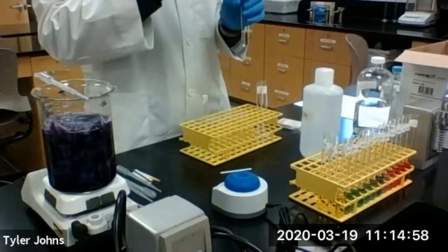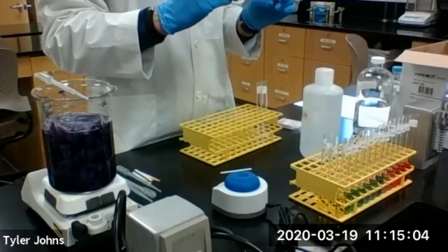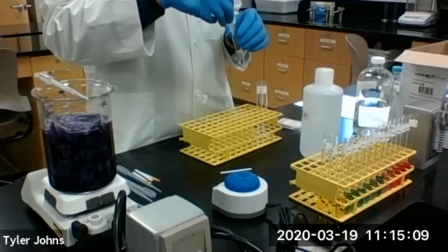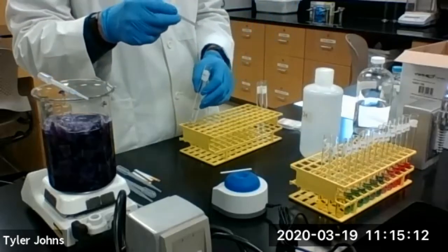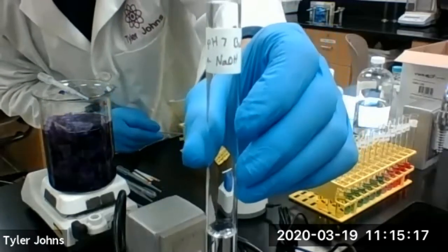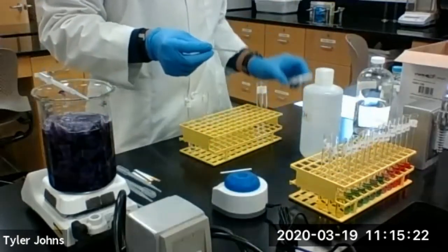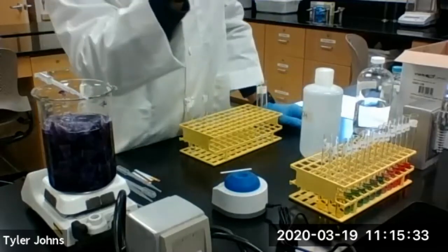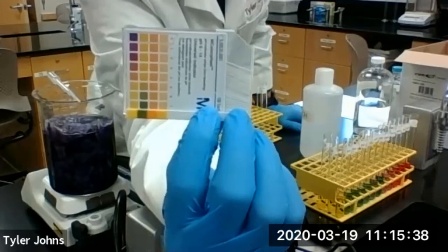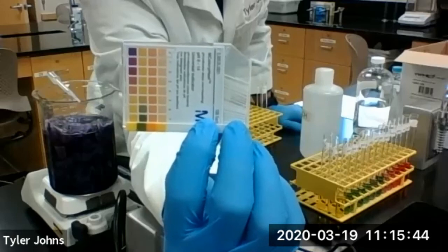And finally, we will check the pH of the pH 7 buffer plus 5 drops of 0.1 molar sodium hydroxide. So our pH 7 buffer plus sodium hydroxide. And this is the pH of the pH 7 buffer plus 5 drops of 0.1 molar sodium hydroxide.